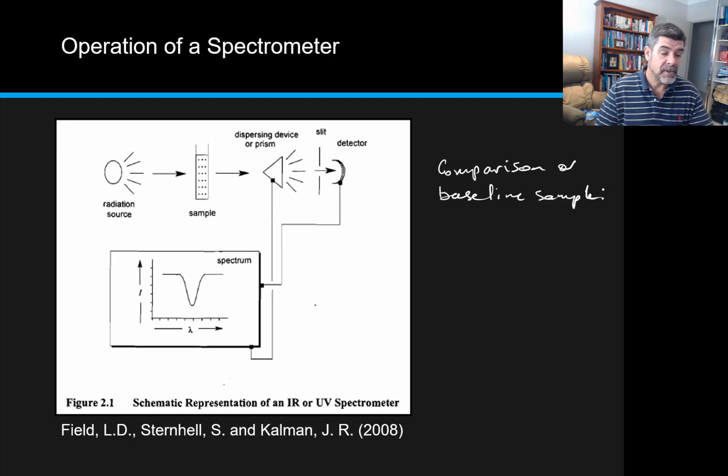graph, and you can see from the graph here that one of the interesting things is that we've got a trough rather than a peak. This is something that sometimes manifests in spectroscopic analyses, as these are representative of the levels of absorbance. If the particular wavelength of light passes straight through the sample, nothing will be absorbed and 100% will go through. If 50% of that was absorbed, we would find a little trough, a little dip occurring, and it would turn at that 50% mark.